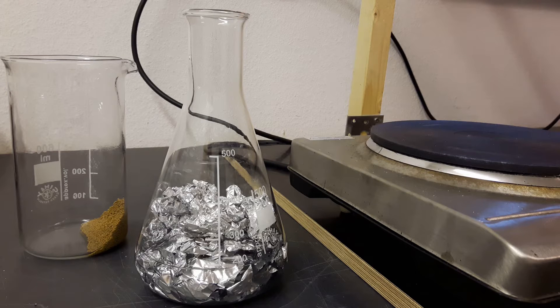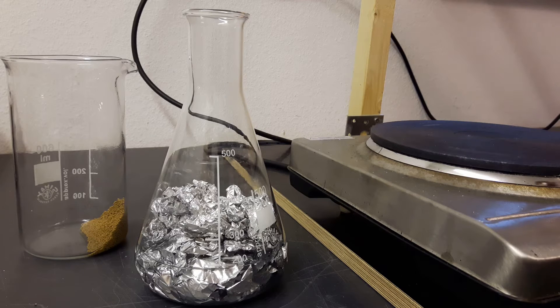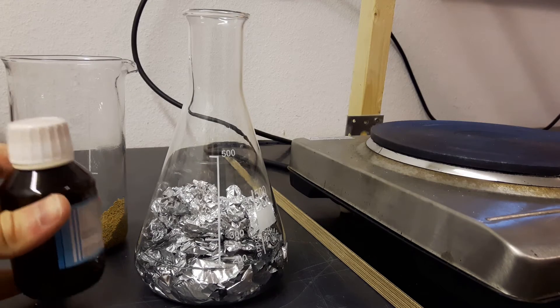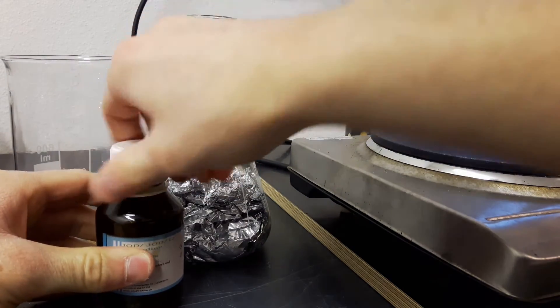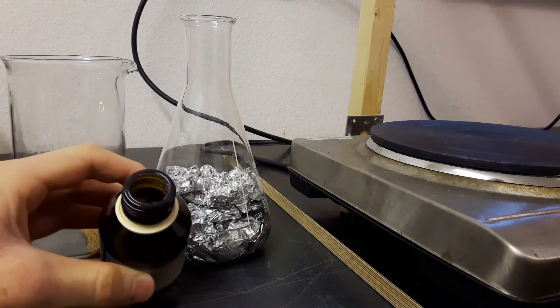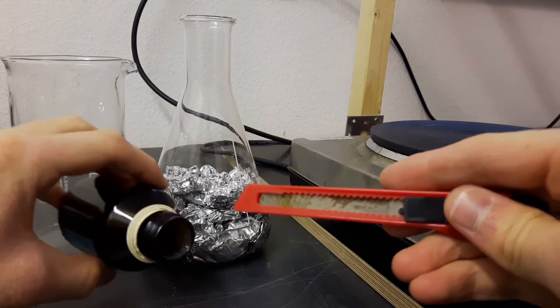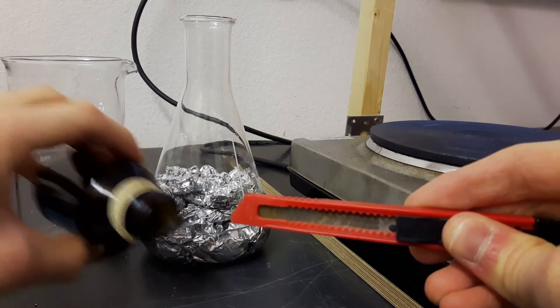And to start off basically you add all the aluminum foil in a flask then you add the isopropanol and finally the iodine. So I used quite a lot of iodine so I think about 5 grams are necessary for this amount of aluminum. And then everything is reacted under reflux.